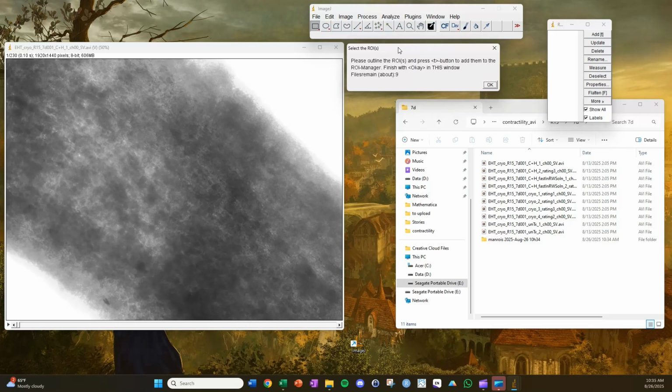We're going to draw the regions of interest in a regimented way, which I'll go over now. So the first step is to click the polygon tool in ImageJ. And you'll have this selected throughout this process. This is the only thing you need to select. And then in terms of which frame you'll be drawing the region of interest in, what I do is I navigate to the frame in which the tissue is taking up less area. The reason for this is that as we scroll across as I play the video, as it beats, sometimes the tissue will take up more area. So here it's like in a state of relaxation, right?